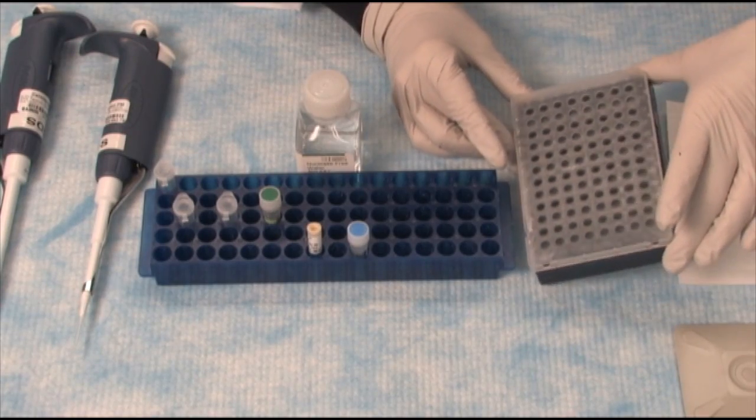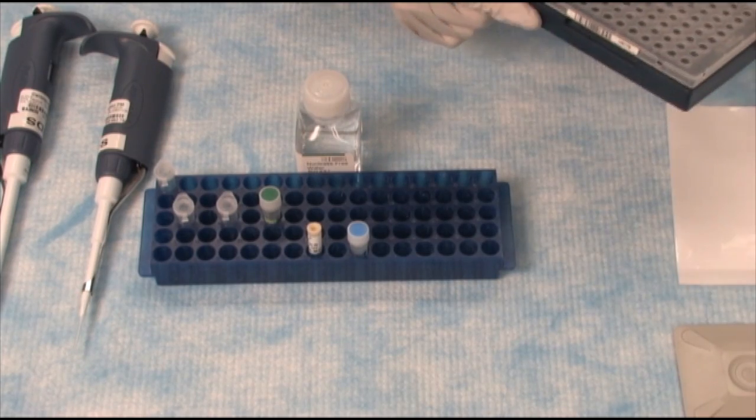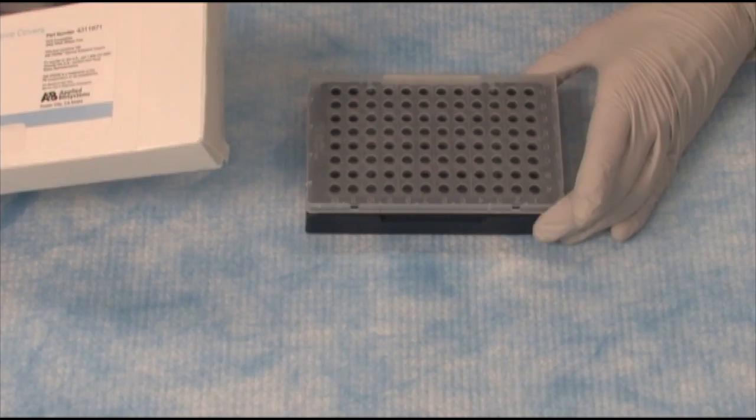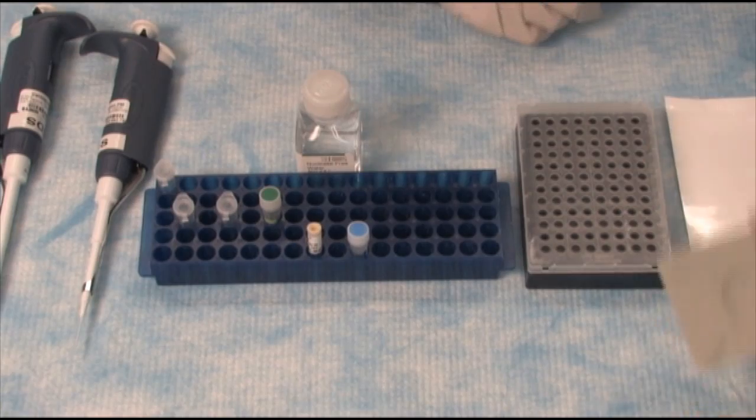Let's recap a typical real-time PCR or qPCR experiment in a plate. What you will require is the actual plate, the plastics, and the plastic holder, the optical adhesive cover, and the optical adhesive sealer.